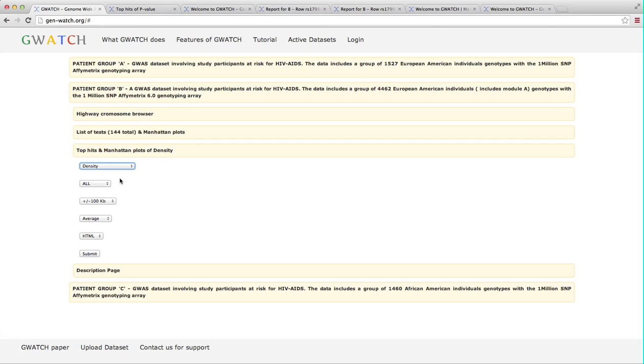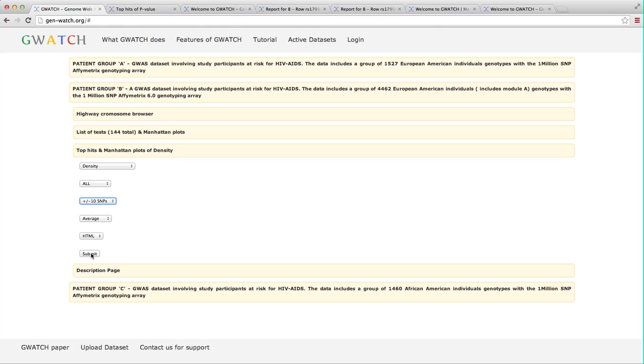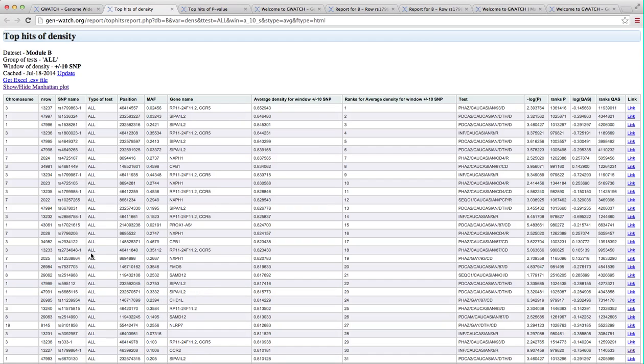Here we simply search across the GWATCH chromosome highway surface for regions that have a high density of towering p-value bars. So, by selecting a particular disease stage, or all disease stage if we want, window size say 10 SNPs upstream and downstream, GWATCH finds region of the genome that display extremely high density of low p-values for a group of tests and adjacent SNPs. GWATCH first produces a table of the dense regions with rank values for density, p-value and QAS.